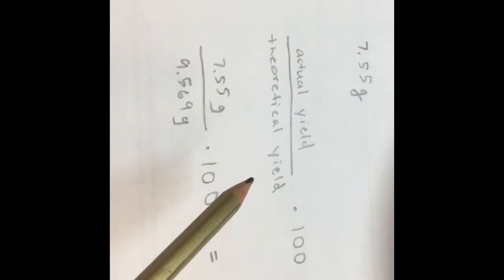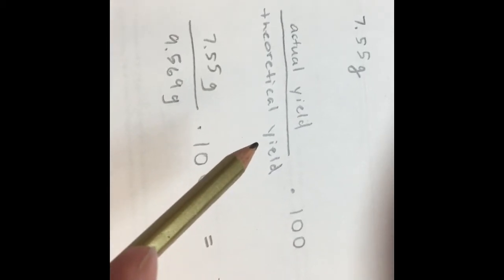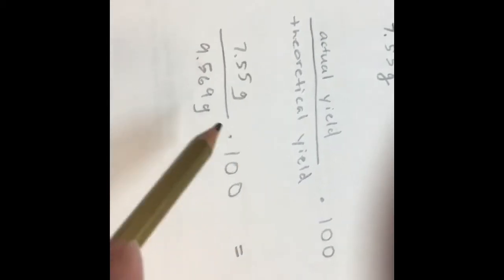So zoom out and take a quick look at that. Right, next we need to calculate the actual yield. We massed the alum after its solid precipitate, 7.55 grams. The formula to figure out the percent yield is actual yield divided by theoretical yield times 100. Our actual yield was 7.55 grams over 9.56 grams, according to right here, if you remember, 9.56 grams. That was the theoretical yield.